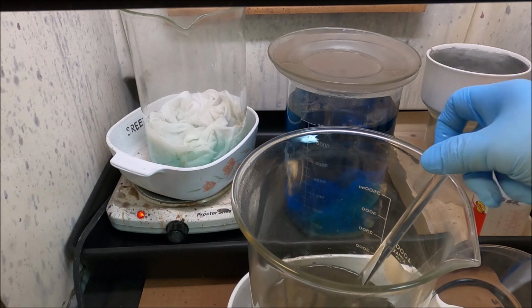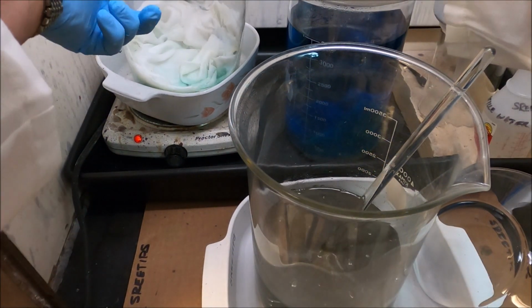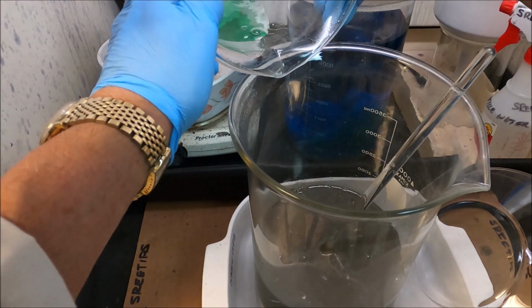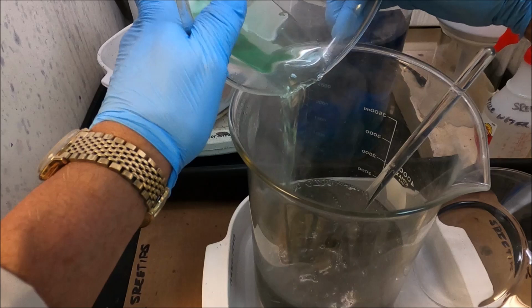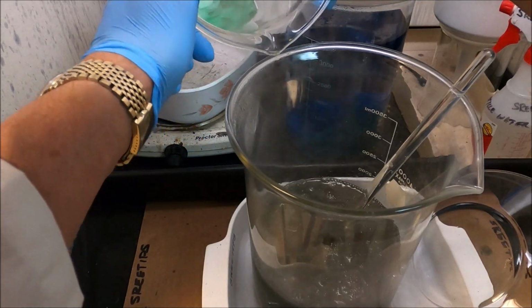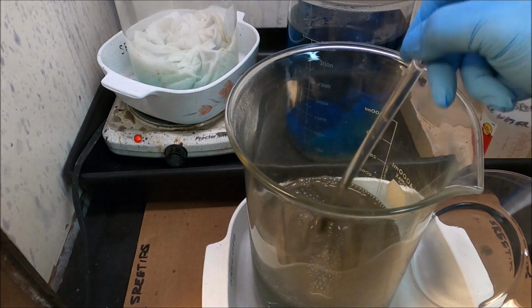Add a little more. That was a timid reaction at best. Add a little bit more hot dilute nitric acid here. It's green. That means we got some palladium in there, possibly. Here we're getting a little bit more of a reaction.